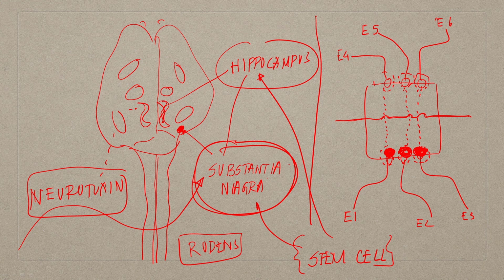Obviously, they do not have many places to go except to sit on top of these electrodes, because the rest of the area is a non-cell-adhering or non-favorable substrate. So, only those dotted lines are the areas where the cells will grow. Similarly, you take the hippocampal neurons and make them sit in this zone, and you allow them to grow. Automatically, once they are growing following this path, they will cross through these tunnels and make connectivity. As soon as they make connectivity, that means they are forming synapses. Okay, they have synaptic connections.